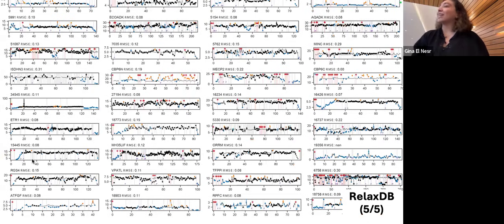And so we have all of this data, but if we want to see, is there something in there that could give us an indicator of an observable that we can try to use for training a model? 133 is not that big of a data set to train a model. I'm sure most people realize this if we compare it to something like UniProt.